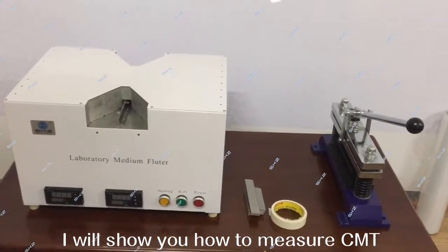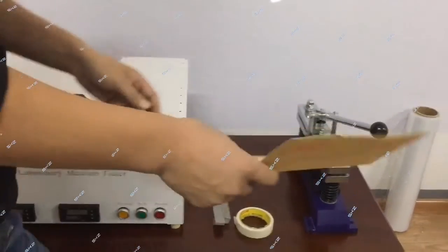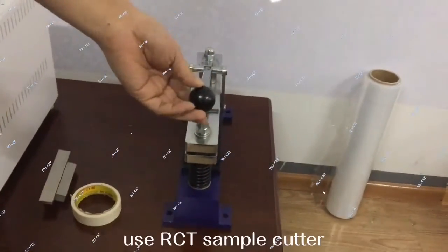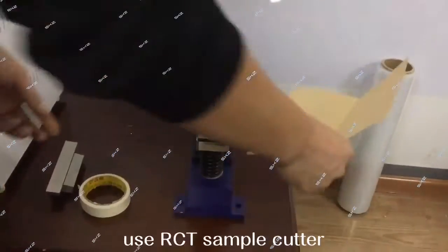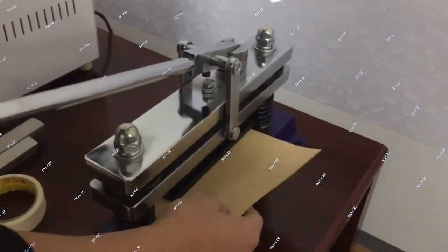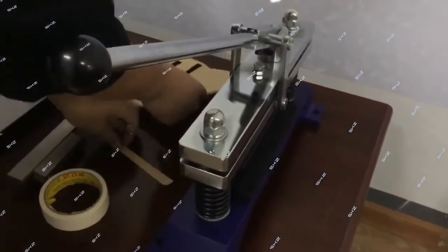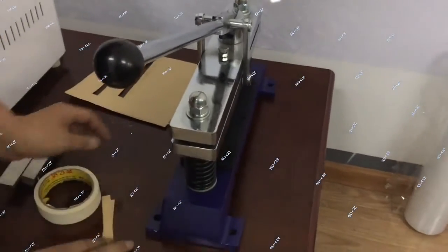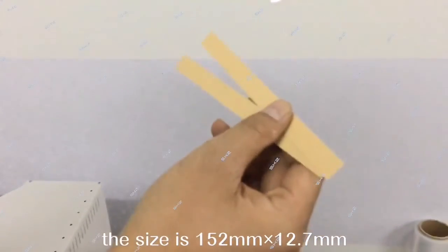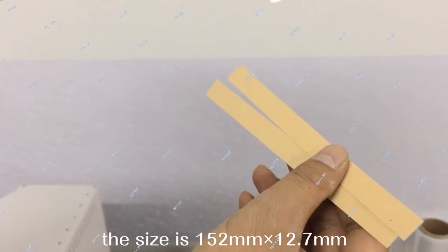I will show you how to measure CMT. First, take the sample and use the RCT sample cutter. The size is 152 mm by 12.7 mm.